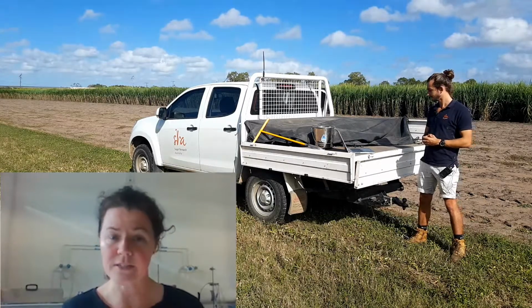Awesome. And what sort of things are these tests sensitive to? So the big ones they're sensitive to are temperature and moisture. All right, and then with those sensitivities, what sort of precautions do we have to take, and how do we handle that with sampling and transporting those samples to you? So we try to make it as consistent as possible, so it reflects what's happening in the field with the farming systems rather than the transport and storage time. So we do it as quick as we can, so overnight, and keep the moisture constant and the temperature as constant as we can.